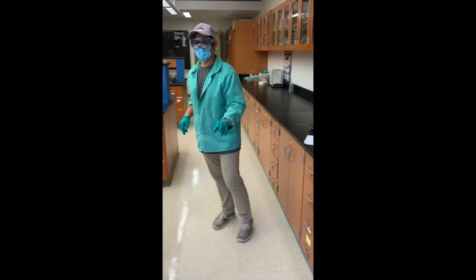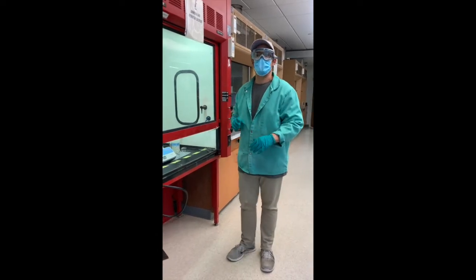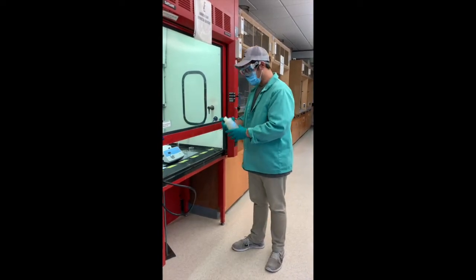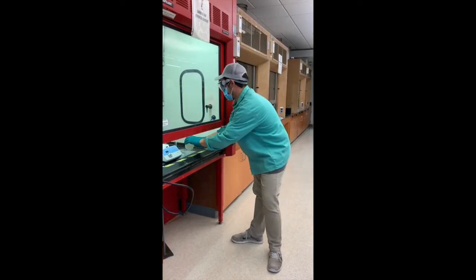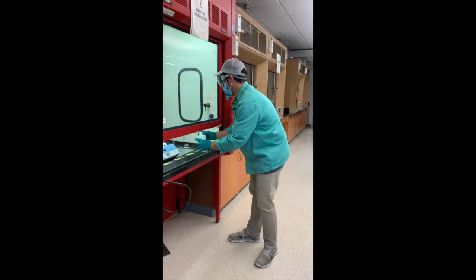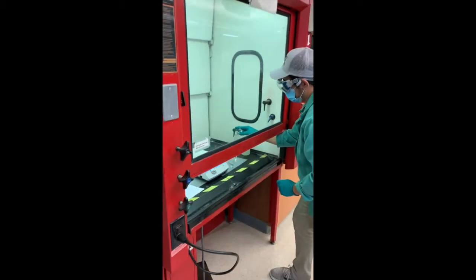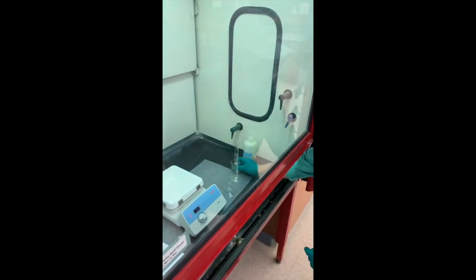On to step 3. Step 3 is going to be done in the hood because we're working with our potassium hydroxide, which is going to be reacting with the aluminum, which we've sanded and weighed out. So using 15 milliliters of 4 molar potassium hydroxide, we are going to react with our aluminum. Right up to 15.